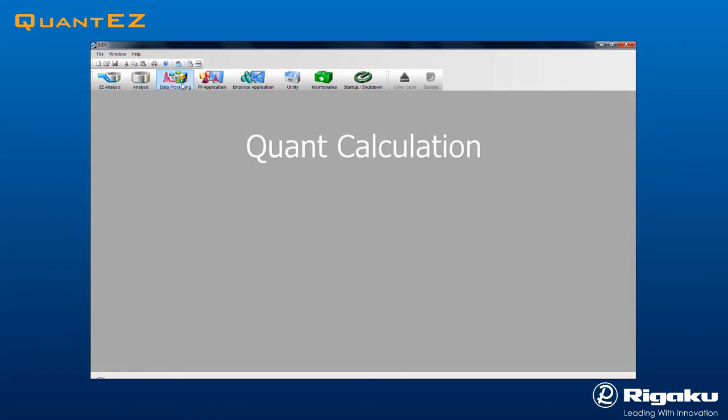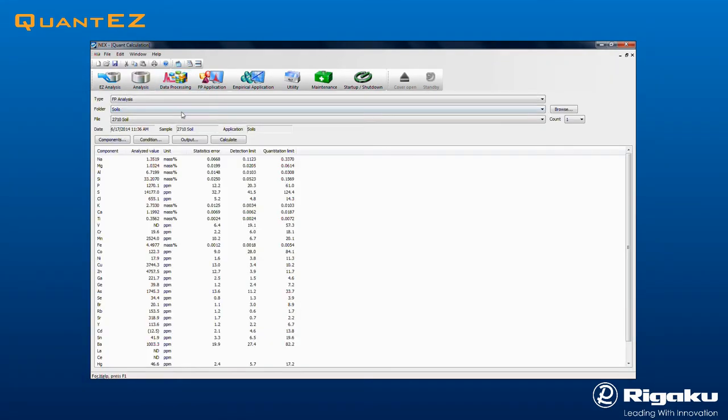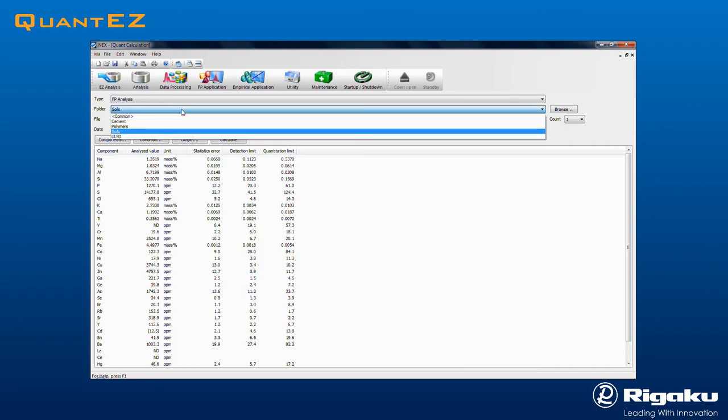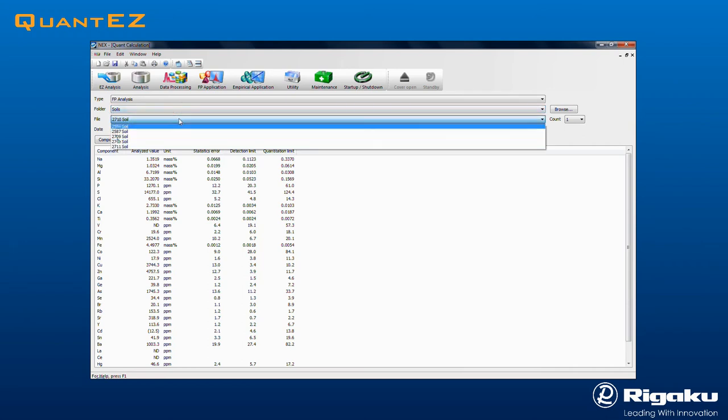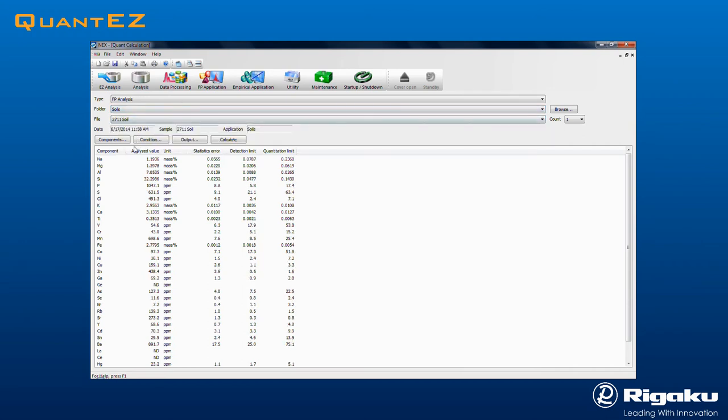To view the results of any measurement in report format, click the Data Processing icon and select Quant Calculation from the drop-down menu. Find the desired data folder and select a result to view.